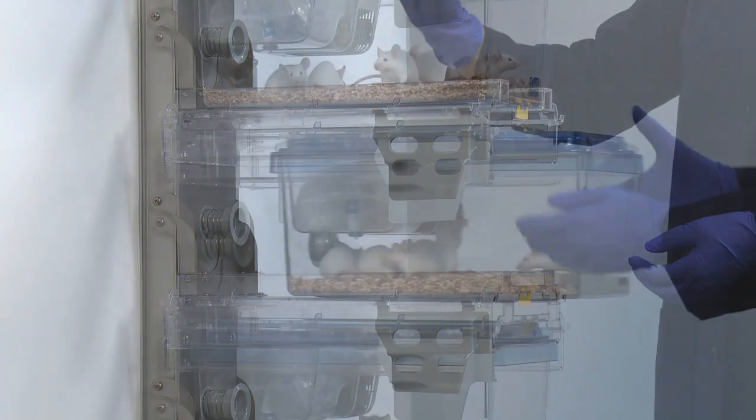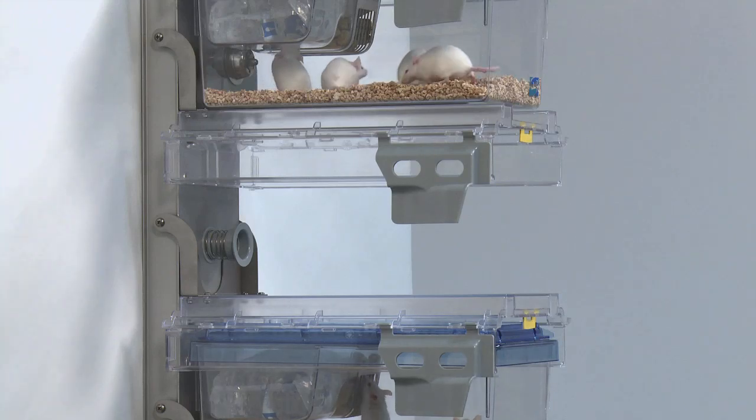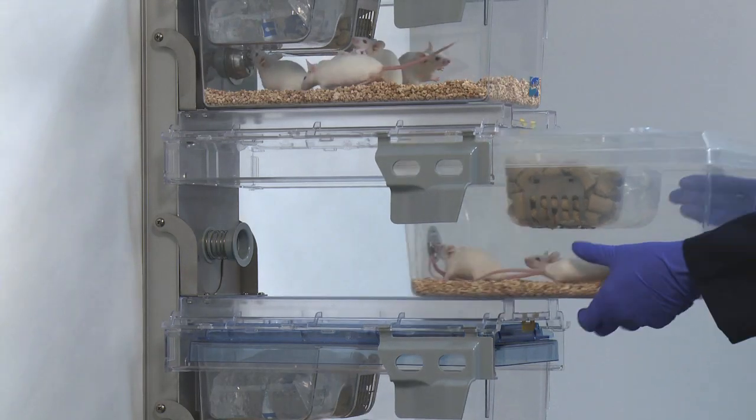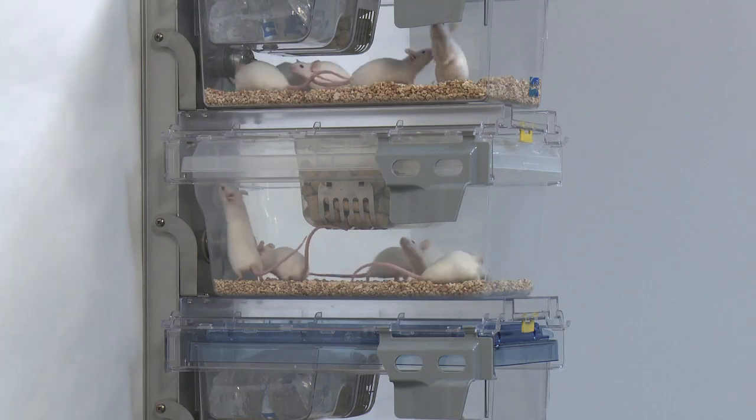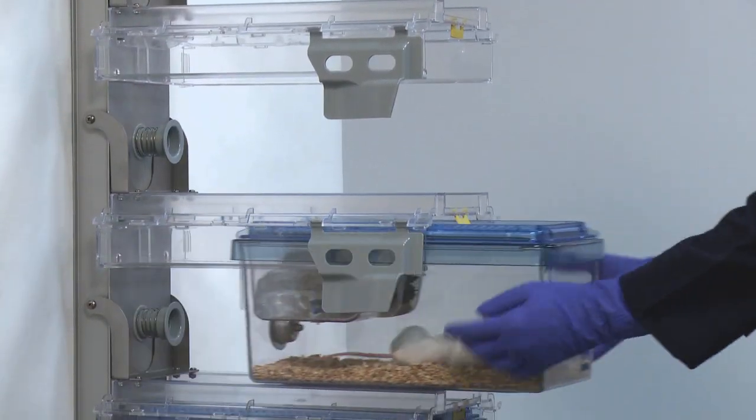Housing standard SuperMouse 750 and compatible caging, the design features lightweight, interchangeable components like our unique ErgoLock, providing unobstructed visibility and making cage exchange even easier.